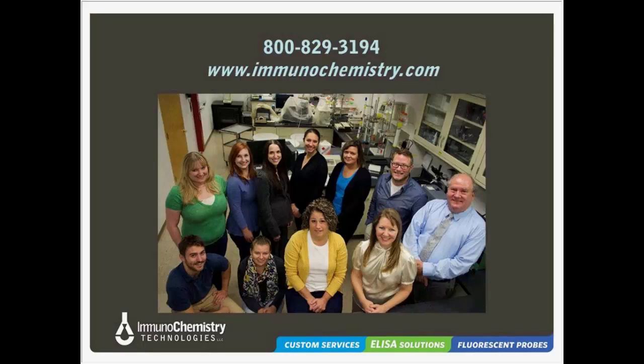Great, thanks, Brian. We also have somebody asking why some blocker stabilizer products give them much lower background signal noise than others they've used. The blockers will vary by the fact that their composition is variable, and in some cases, when you have smaller molecules or a different type of molecules, whether you're using a synthetic, detergent type blocker, a non-mammalian protein type blocker, or a carbohydrate type blocker.